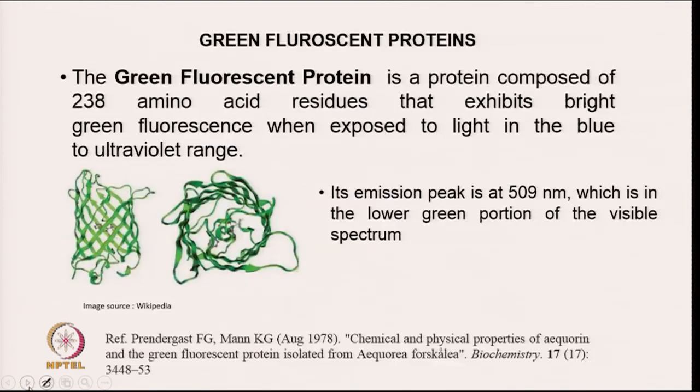Some of the tissues can be seen with autofluorescence, but some of the applications need the use of what is known as green fluorescent proteins. So let me first discuss green fluorescent proteins, and then I will discuss how they can be used for various applications.